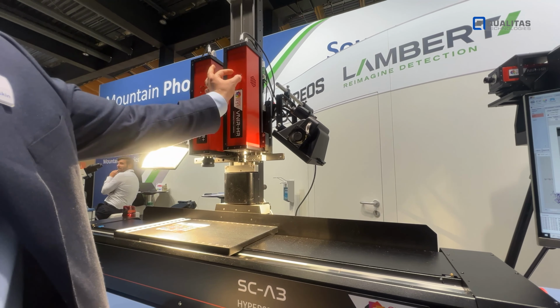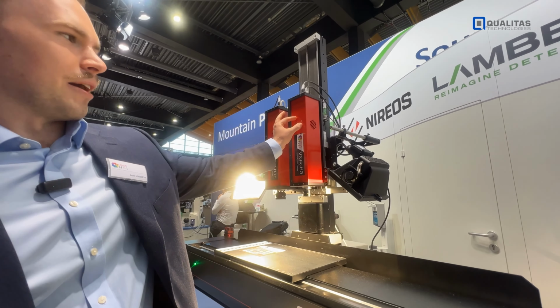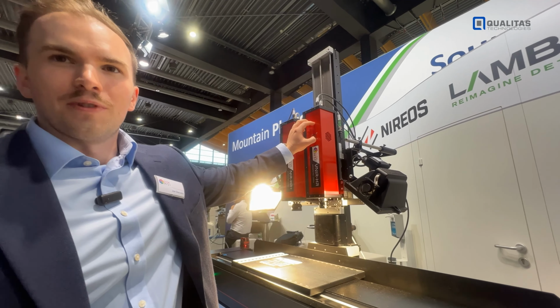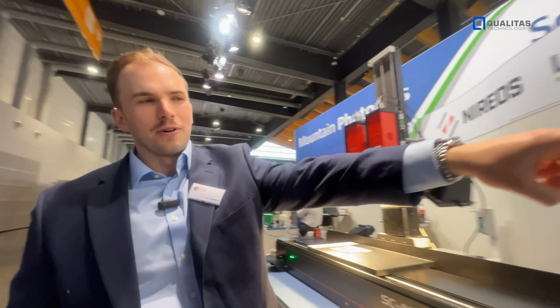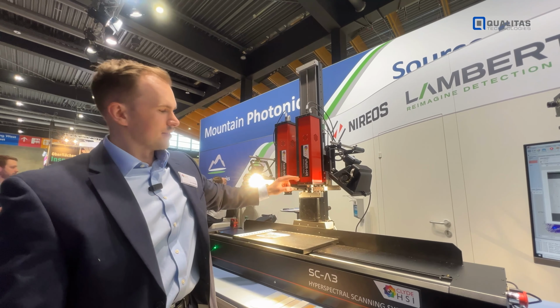We then focus that light from the rainbow. There's some light grating. Yeah, exactly. It's a spectrograph in here. Then we have another lens which focuses the rainbow onto a focal plane array sensor, which then we record. So you have sensor, spectrograph, entrance slit, and lens.